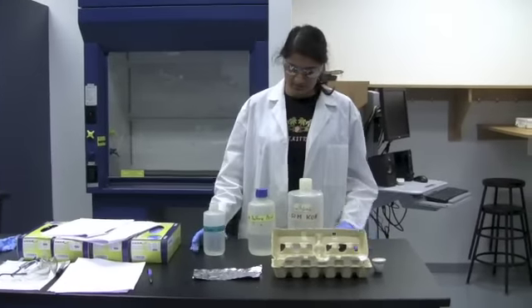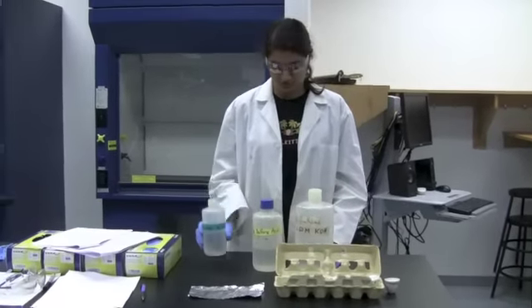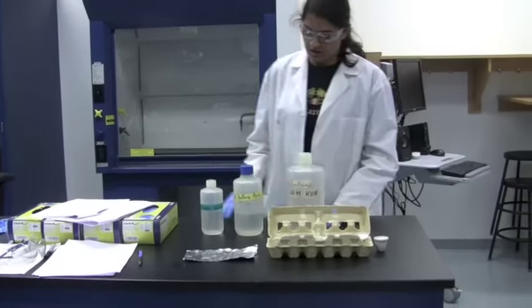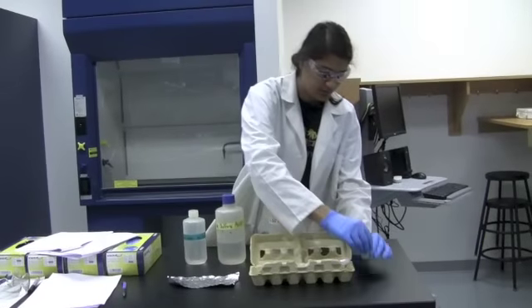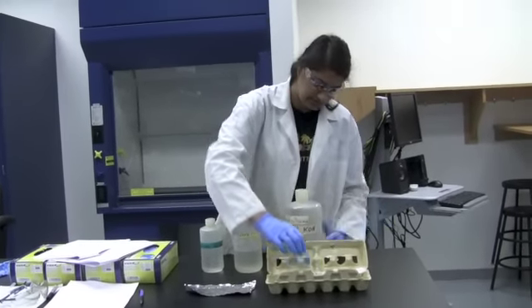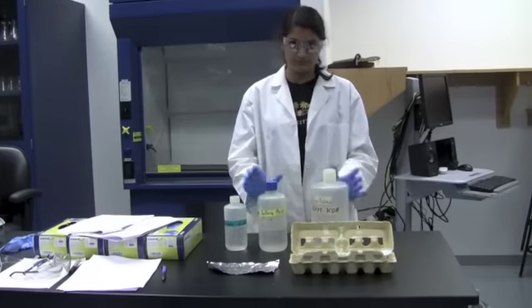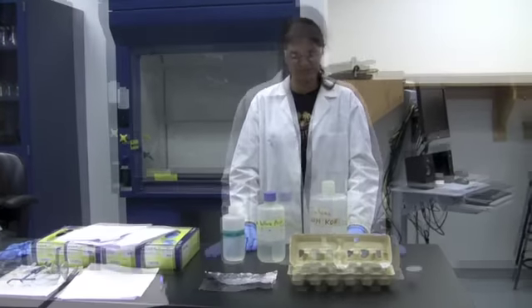In week 1, these are the materials that you're going to be using. You're going to need the water alcohol solution. You're also going to be using some sulfuric acid and potassium hydroxide. You'll need some aluminum foil, and lastly in week 1 you're going to be weighing a crucible. Now remember, when you're handling the sulfuric acid and the potassium hydroxide, that you should be wearing rubber gloves because they are 1.5 and 3 molar.